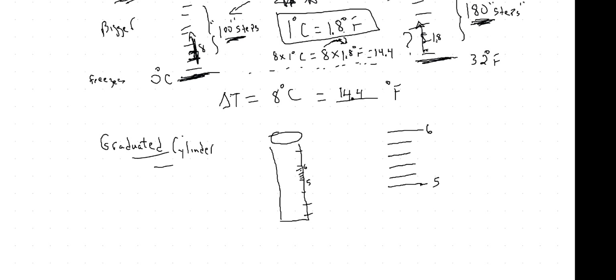Okay, there's 4 markings in between. And then if the reading, and I'll do that in a second, in other words, if the liquid comes up to a certain point, we're going to put a liquid in here that I'm going to talk about. Just say the liquid comes right up to here, and the question is, what is that reading? What is it right here?